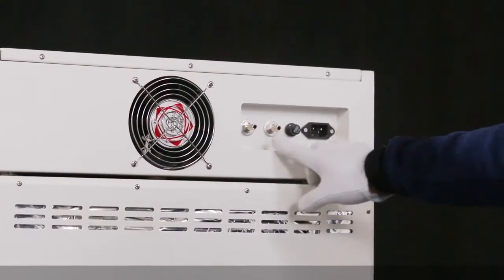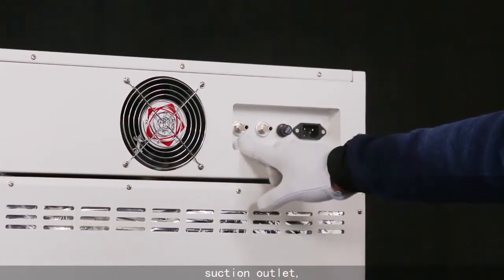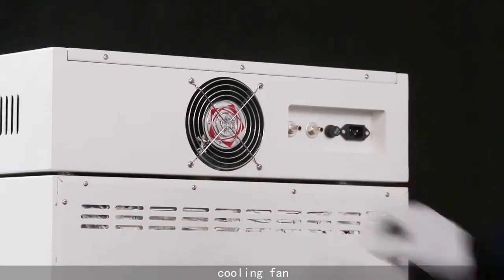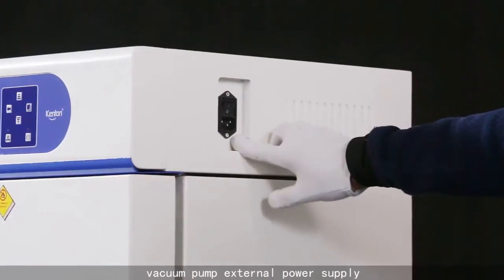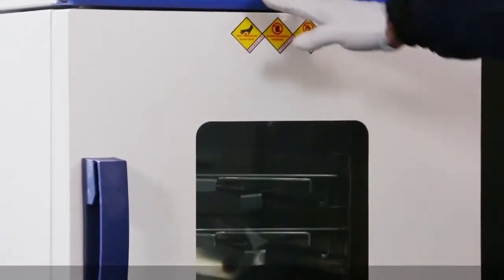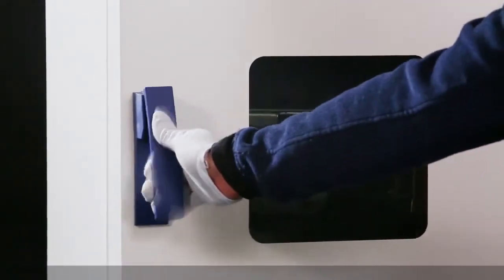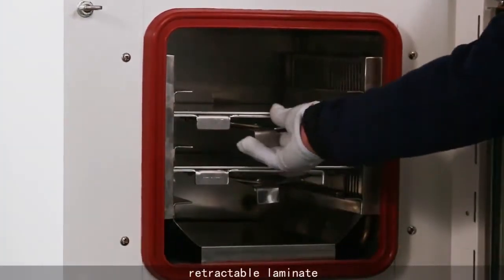Air Inlet, Suction Outlet, Cooling Fan, Vacuum Palm External Power Supply, Micro Computer Control Instrument, Retractable Laminate.